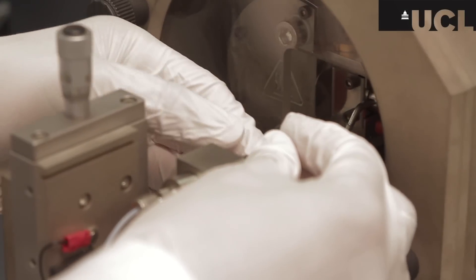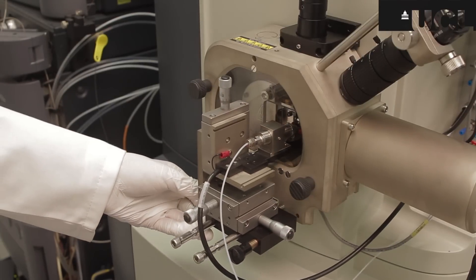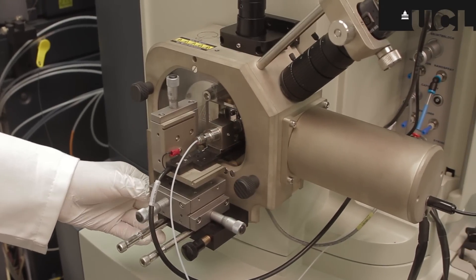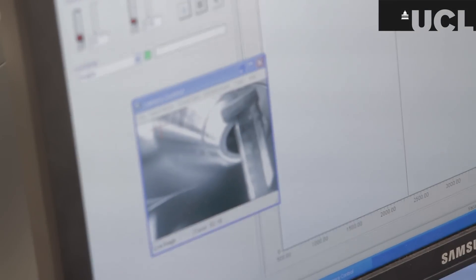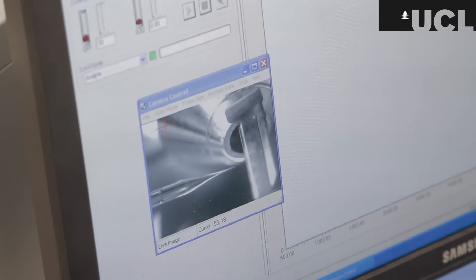It is loaded onto the mass spectrometer. Technical replicates are required in order to obtain reliable data. The fine end of the needle can be now seen very close to the sampling cone where the sample will travel through.